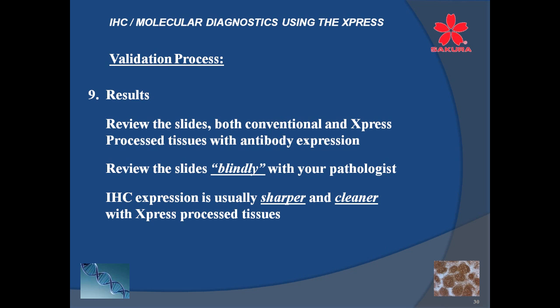You know about xylene. But the Xpress reagents, or most of these reagents, do not use xylene as a clearant. So you're getting rid of something that's bad to begin with. And with the petroleum industry as it is, at some point it wouldn't surprise me if xylene goes away, just like a few of the other things that we'll chat about in just a moment. It's very critical now with the petroleum industries.